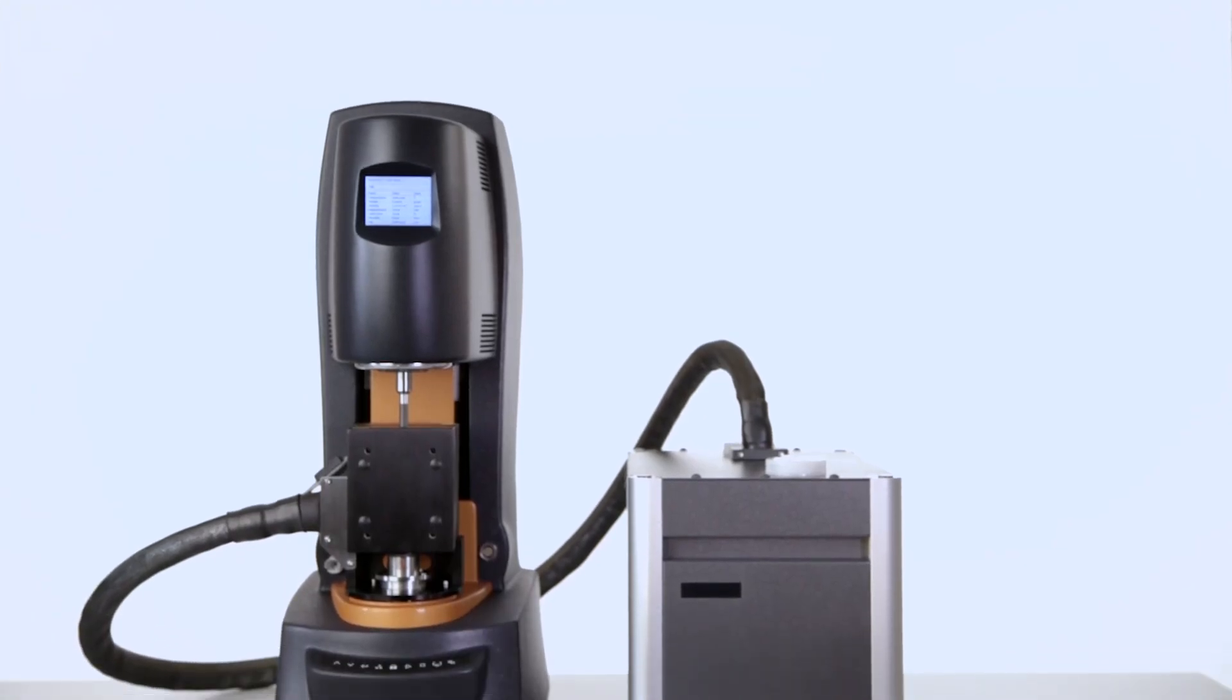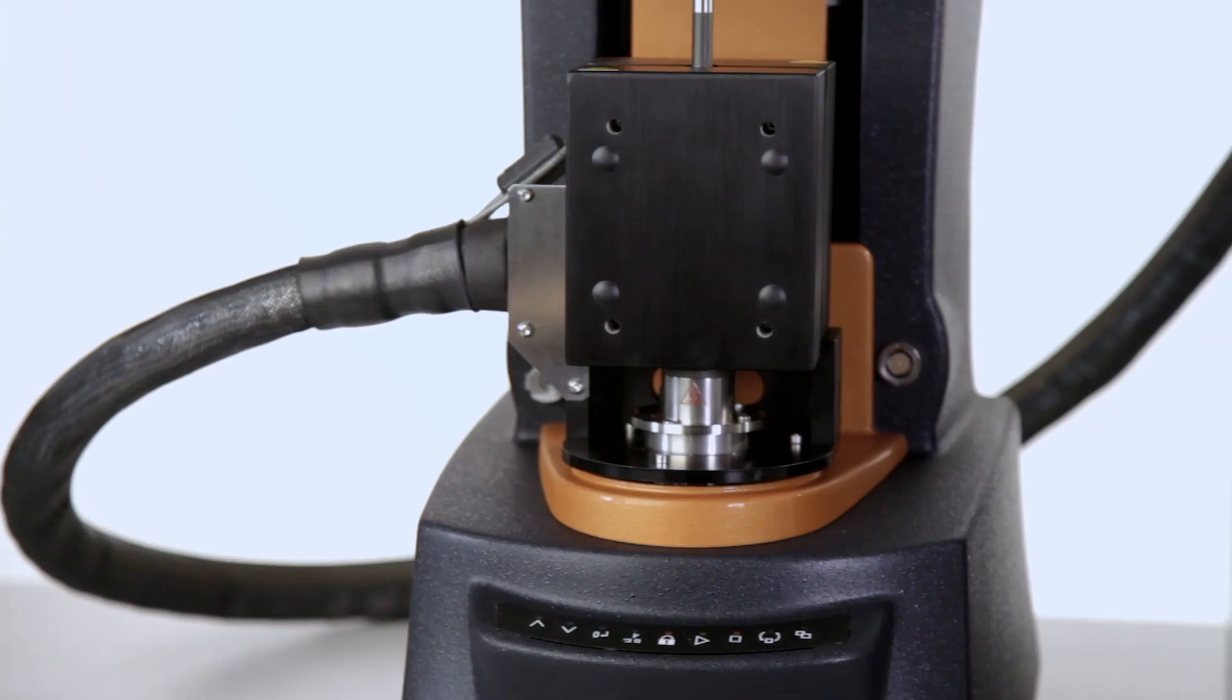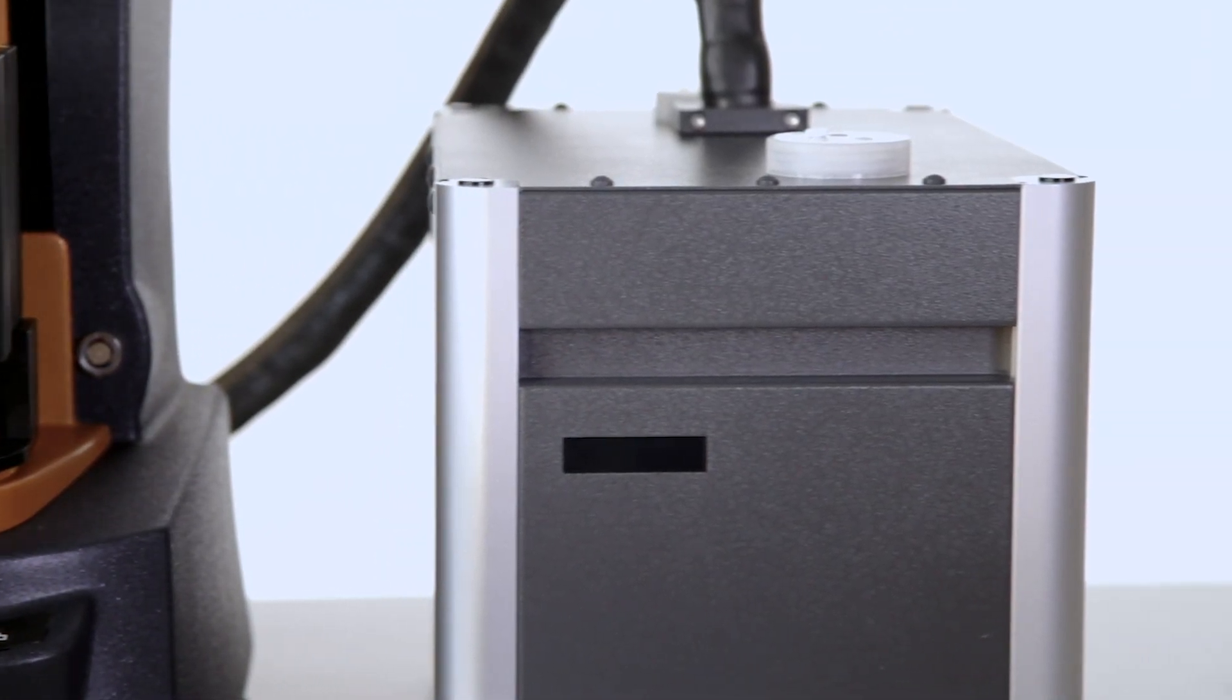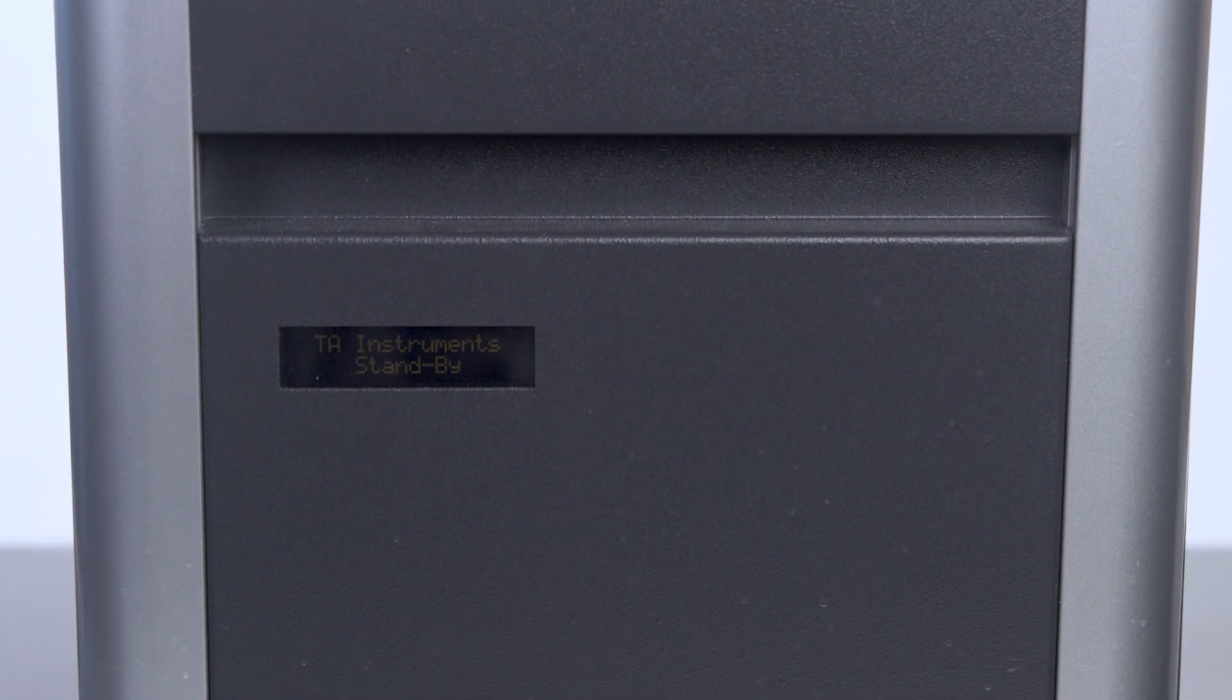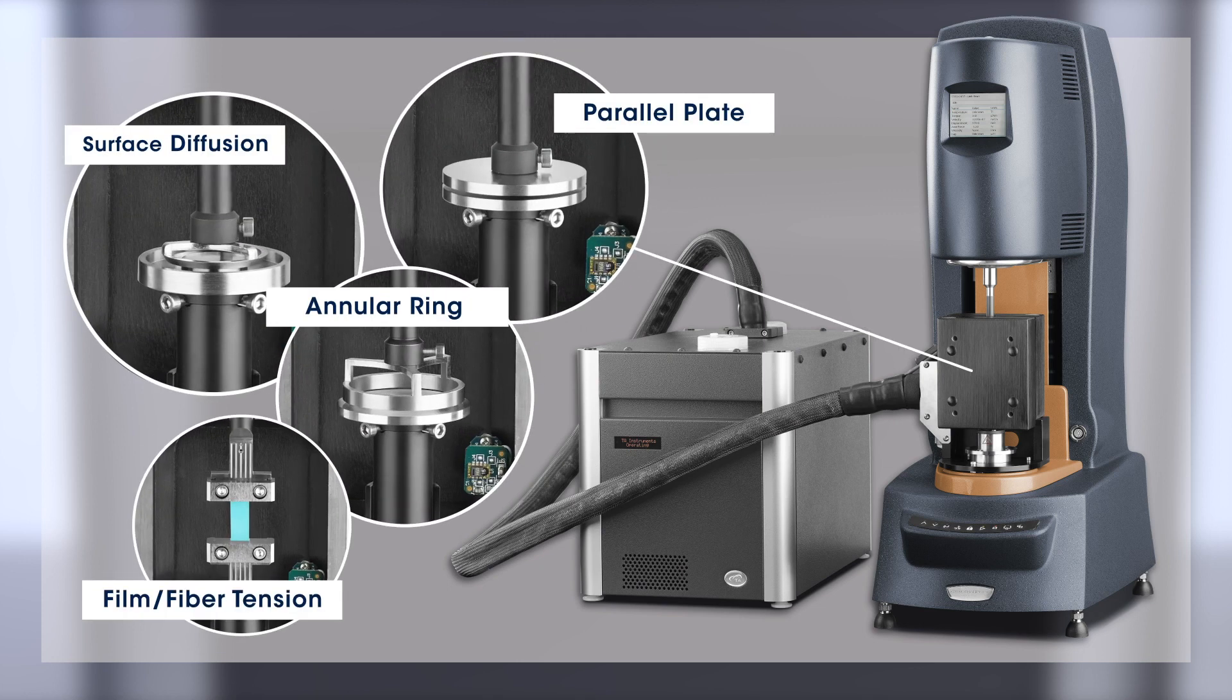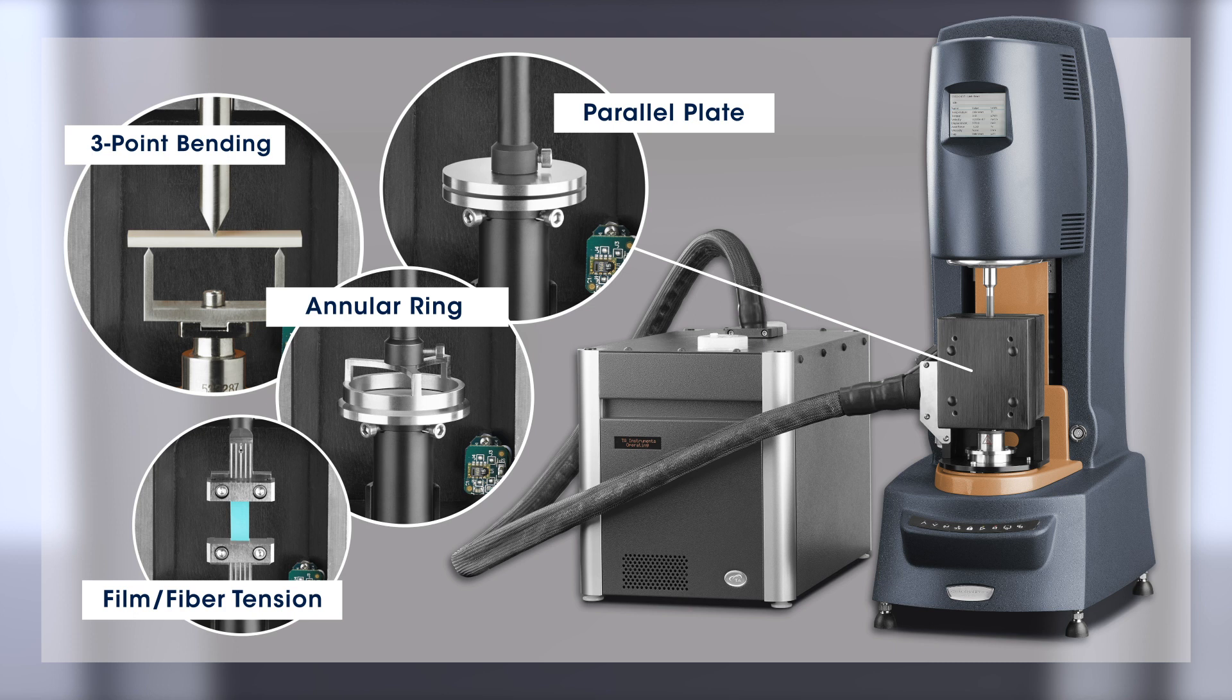The relative humidity accessory on the DHR rheometer is a powerful tool which allows users to monitor the rheological property change of a material under both controlled temperature and humidity. This humidity chamber is used in combination with a series of geometries for testing varieties of different types of samples from low viscosity liquid to solid.